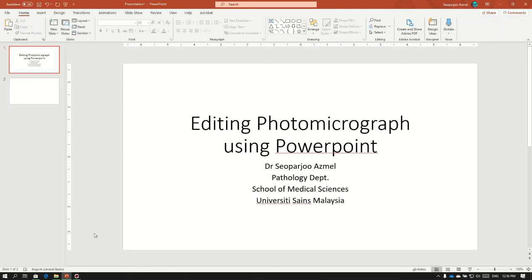Okay, good morning. I'm Dr. Suparjo from School of Medical Sciences, University Science Malaysia. So today I'm going to show you how to edit a photo micrograph using PowerPoint.